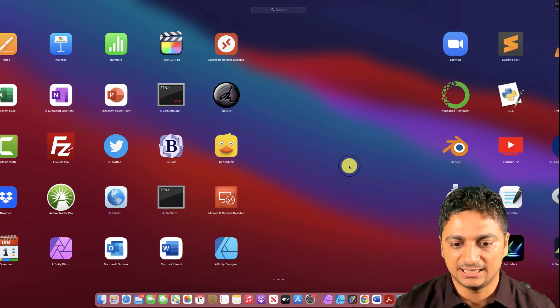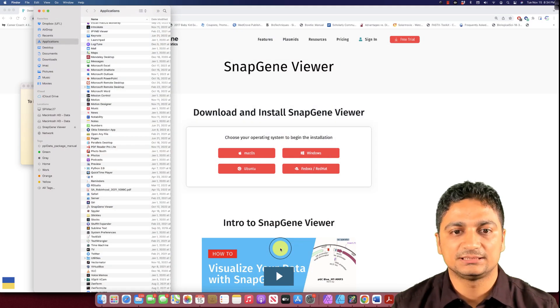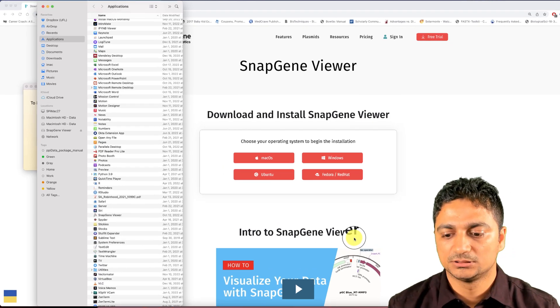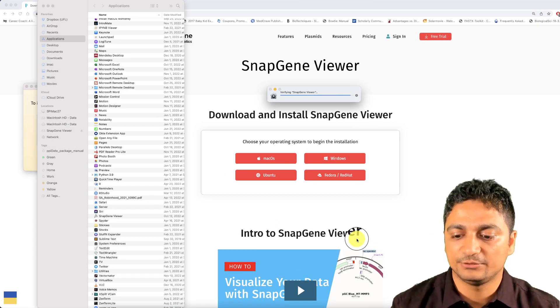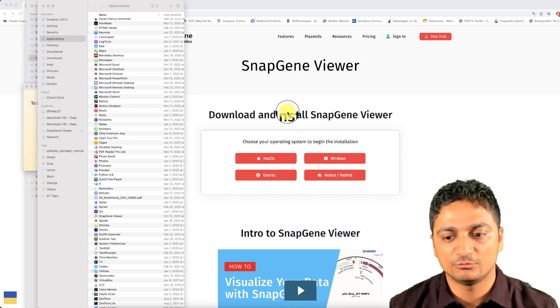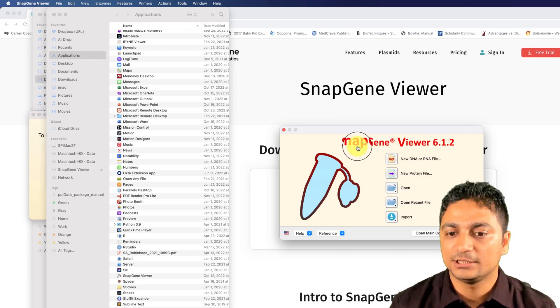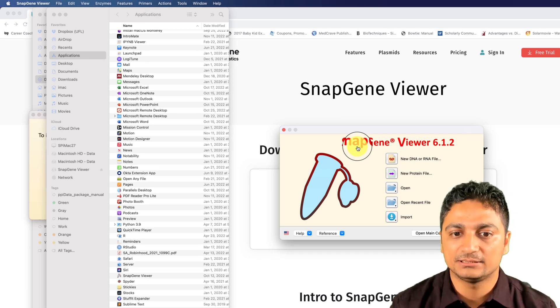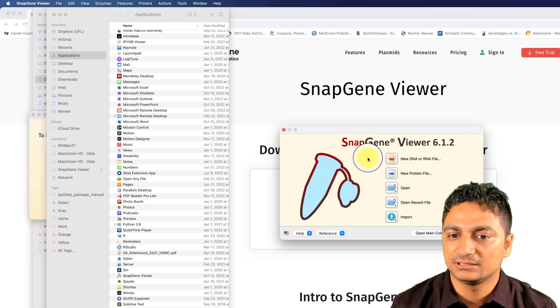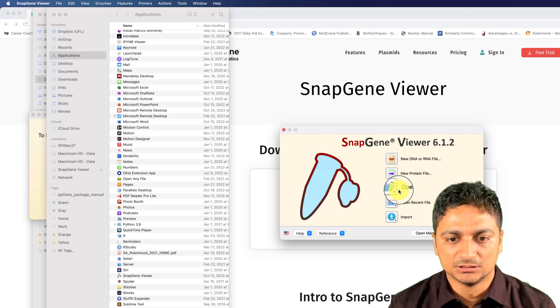I can see SnapGene Viewer right here, so now I can go to my Launchpad and see if I have SnapGene Viewer. I have it right here, so let's click and open it. Remember this is a free version with limited use. If you want annotations, cloning, and enzyme features, you might need SnapGene, which is a paid version — I think it's around $700 to $1,000.